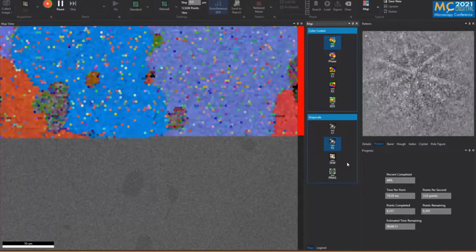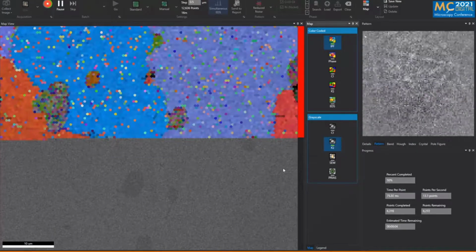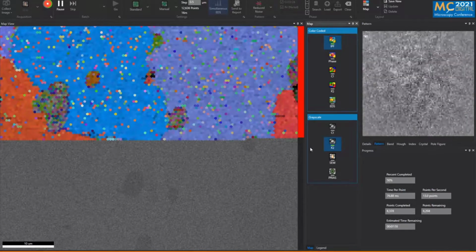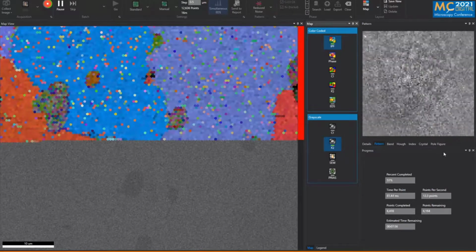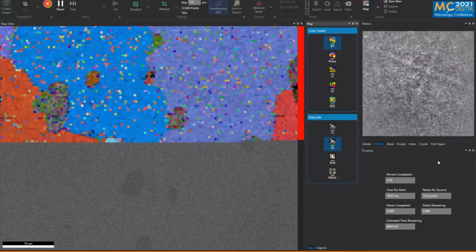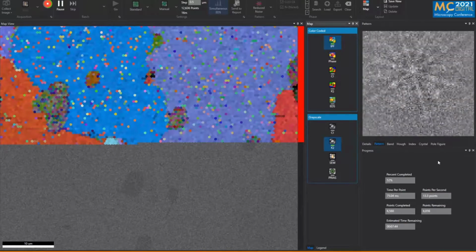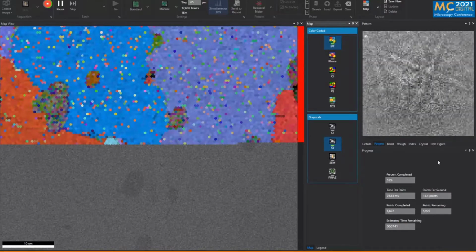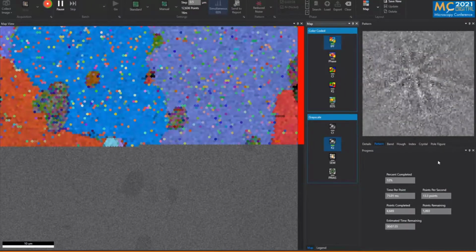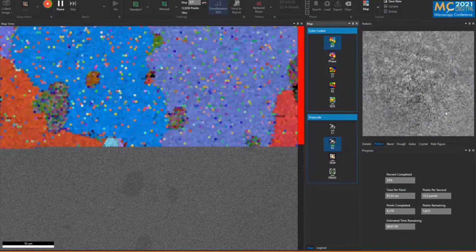Let's just let it go for a little while longer. I'm not going to wait another 8 minutes, but just a little bit further. We can already see the grain structure quite nicely. We can see the carbides nicely, but also the diffraction patterns are really quite weak. And in this case, we know that we are capturing virtually all electrons that hit the detector. So we're really seeing that. And that means that the beam current is now so low that we only have a few electrons that actually form the bands that we can see here on top of our background image for the background intensity.